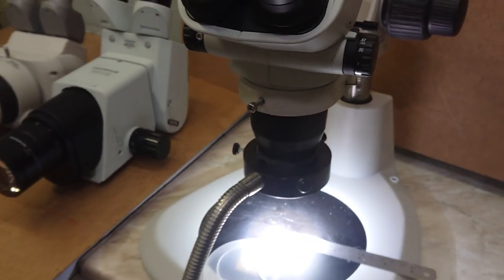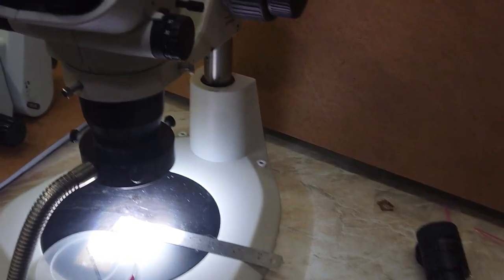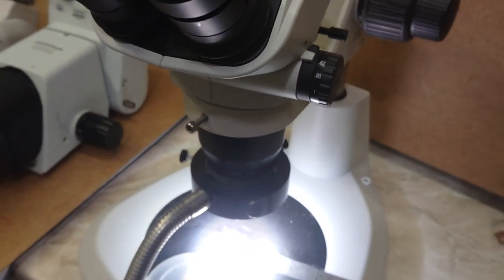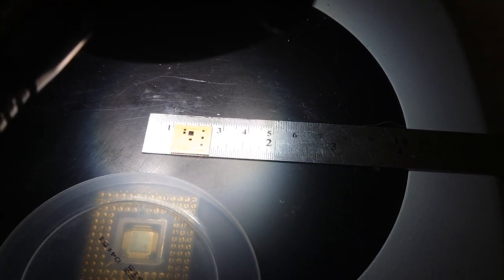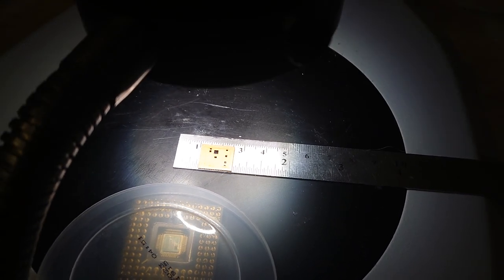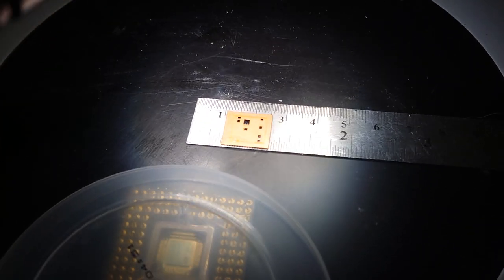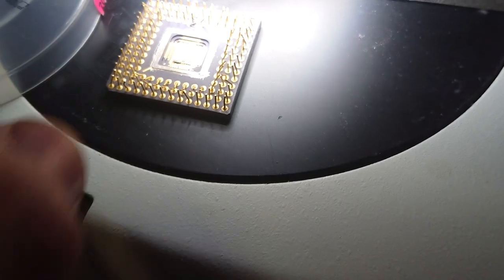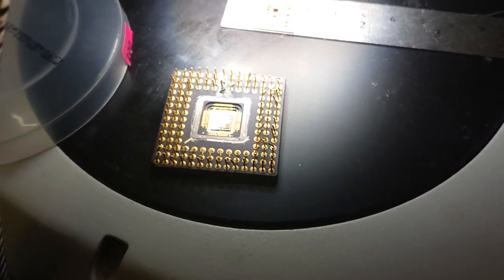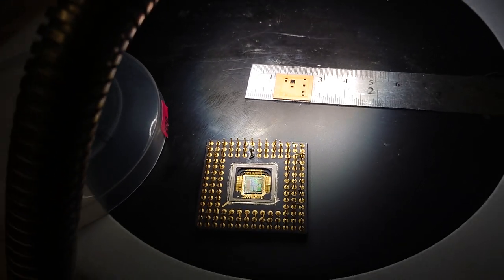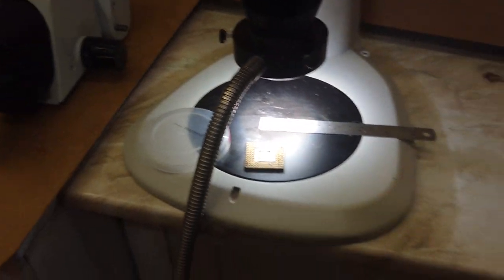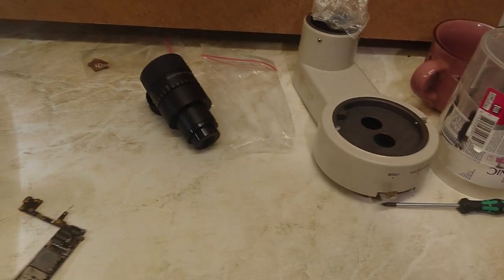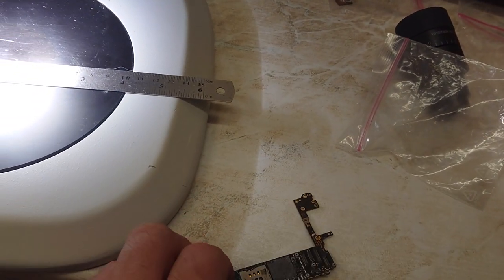Let's see the field size with lower and highest magnifications. I have a little ruler here. I have prepared Apple's A-series processor and I have prepared my favorite Intel i386 processor here, so we'll use them to see resolution. By the way I brought a piece of motherboard of my iPhone 7 or something like that, we'll use it for evaluation too.